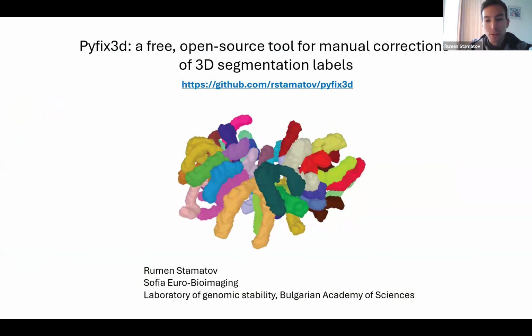Sofia Euro-BioImaging node from Bulgaria. And I want to share this tool, which is for a very specific stage of image analysis. It's really simple, free and open source.